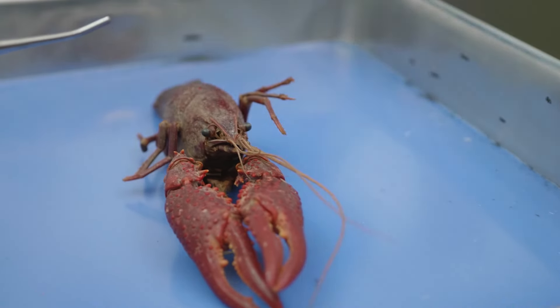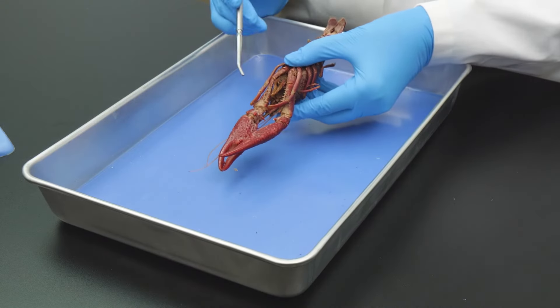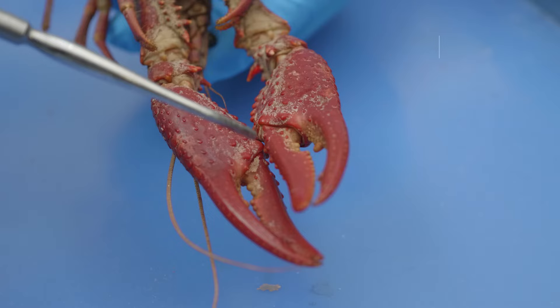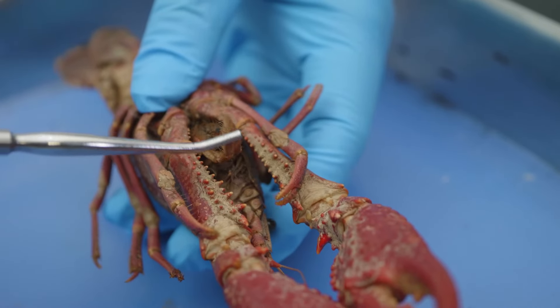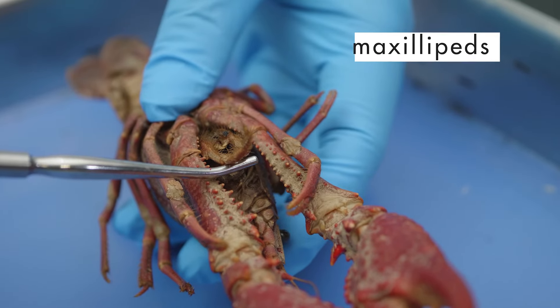The other appendages are best seen if we flip the crayfish onto its dorsal side. The longest appendages are the two long chelipeds. Each cheliped is equipped with a large claw for capturing prey. After the crayfish catches its prey, the chelipeds pass food to three pairs of shorter appendages called maxillipeds, which pass the food to the mouth.